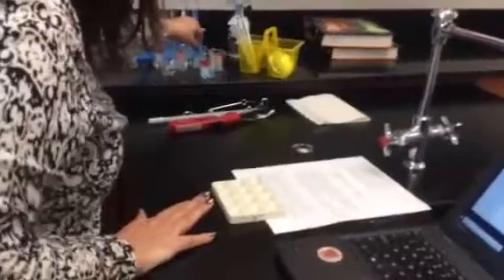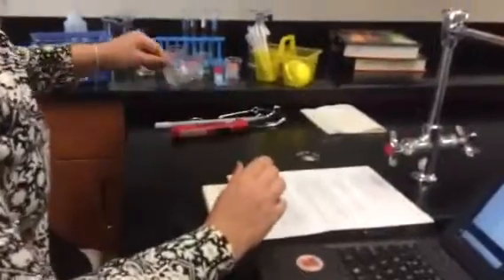So we're familiar with the spot plate or well plate, and you're going to take a piece of zinc and you're going to put it in here, and then you're going to just look. It says record your observations, and you're just going to look at it. And then fill the well 2/3.